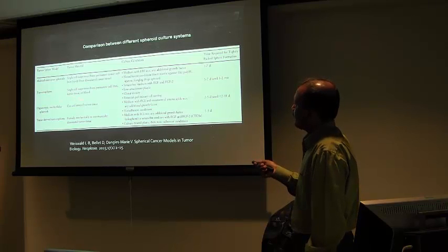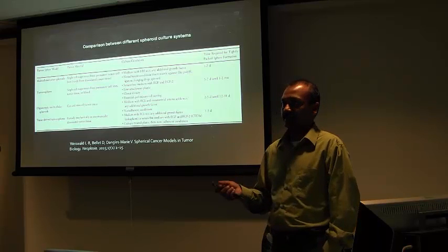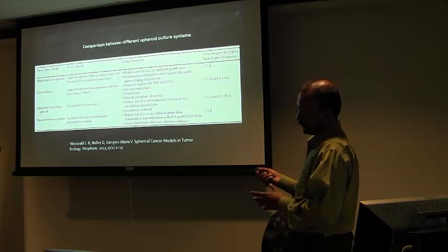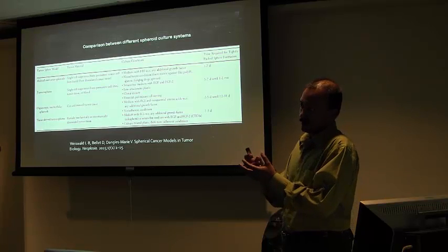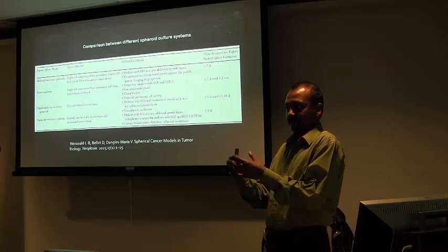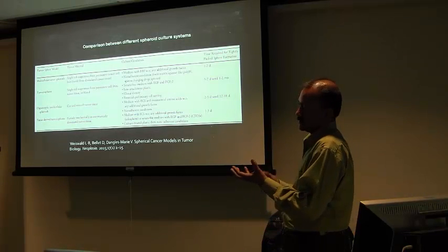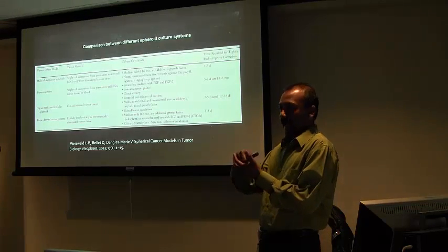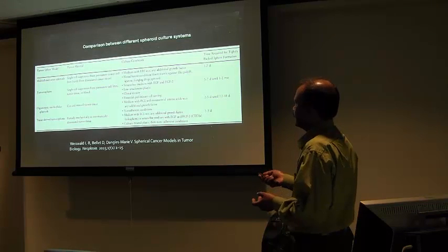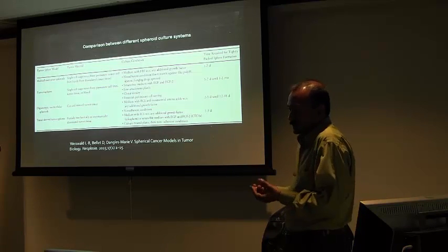This one actually has tumor stem cells or tumor initiating cells in the middle of the sphere. So it is believed that tumor spheres are formed when the tumor initiating cell in the middle self-renews and gives rise to differentiated cells. So each colony or each tumor sphere has a tumor initiating cell in the middle, and it gives rise to the tumor sphere. It maintains the tumor sphere. So as opposed to the multicellular spheroid, this is a sphere that is formed spontaneously.